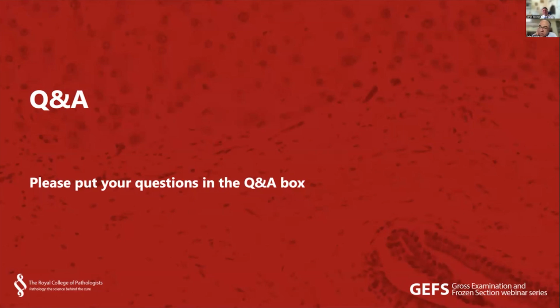This is a question regarding metastatic nodes, and you mentioned nodes along the specimen as well as the high pedicle specimen of the node. So, what is the significance of metastatic tumor in other nodes, but a negative apical node? Whether or not the high tie node is involved doesn't affect the TNM classification.